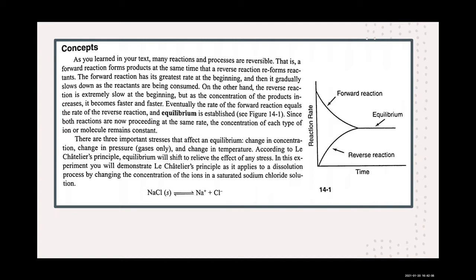Since both reactions are now proceeding at the same rate, the concentration of each type of ion or molecule remains constant. There are three important stresses that affect an equilibrium: change in concentration, change in pressure for gases only, and change in temperature. According to LeChatelier's principle, equilibrium will shift to relieve the effect of any stress. In this experiment, you will demonstrate LeChatelier's principle as it applies to a dissolution process by changing the concentration of ions in a saturated sodium chloride solution.